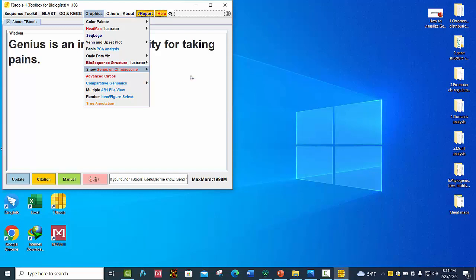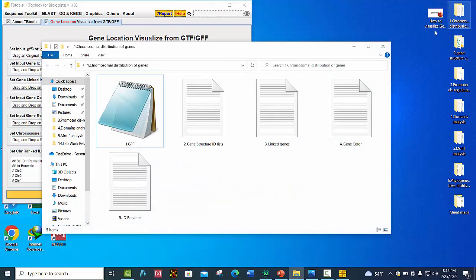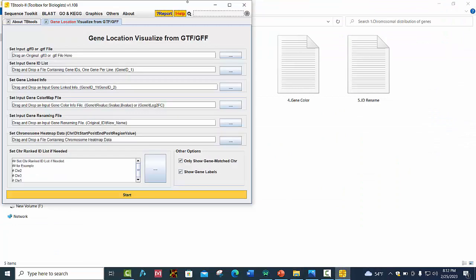Here you can see there are different files available. To map your genes on chromosomes, you need these four to five files. Let's place these files one by one.